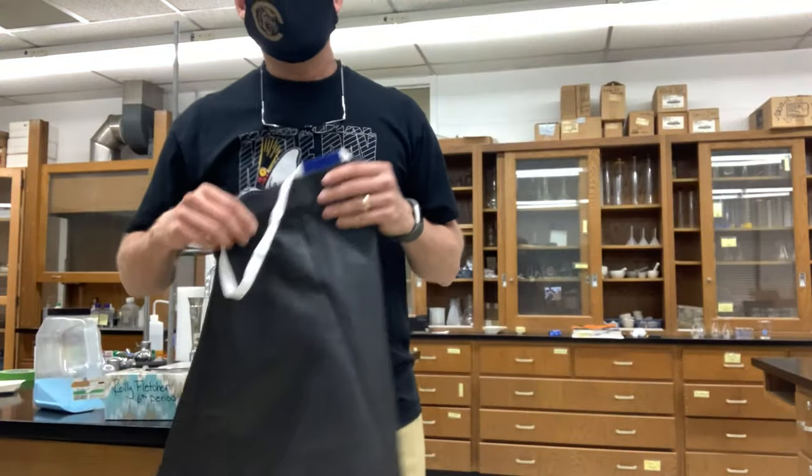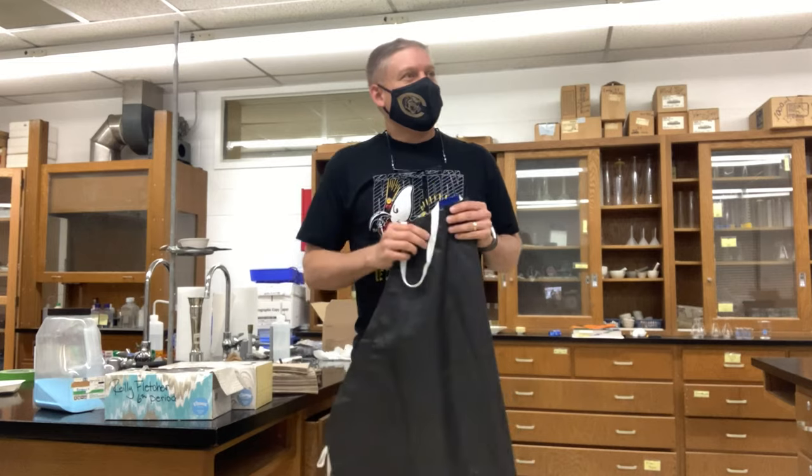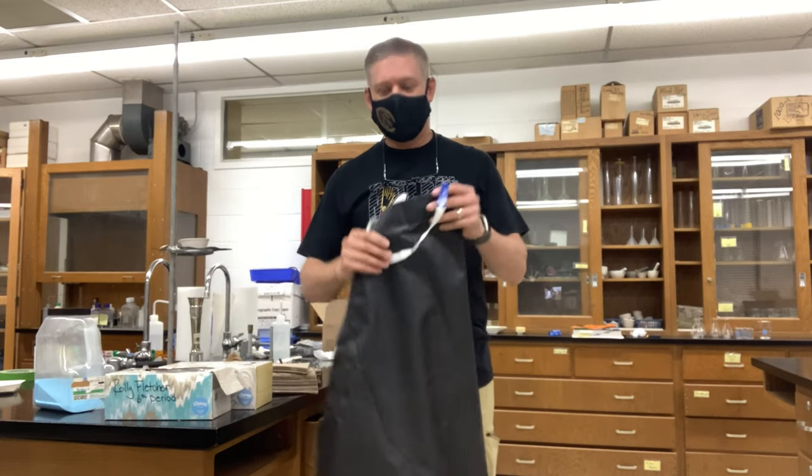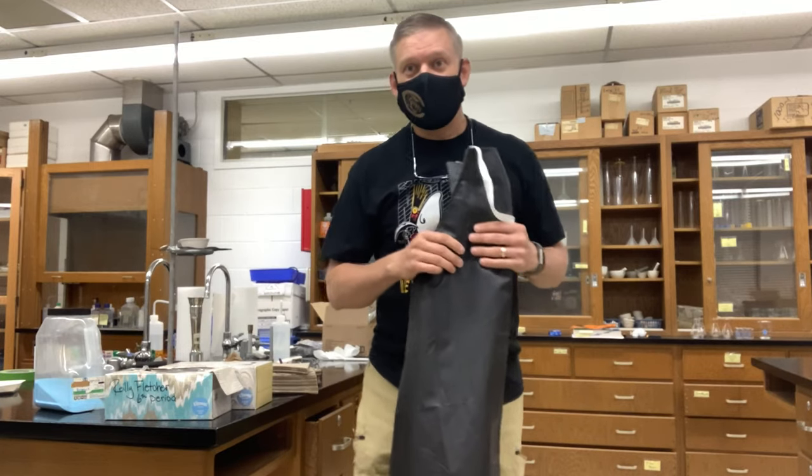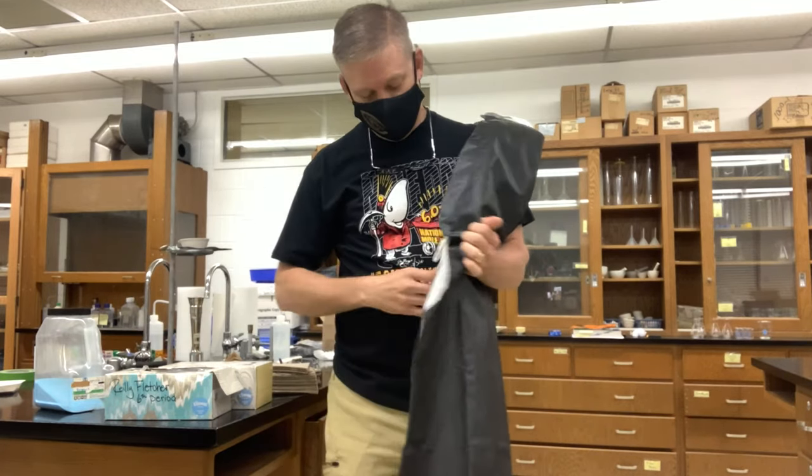Today I wanted to show you about our lab aprons. Some people have had trouble with their lab aprons, especially tying them. So I cannot take credit for this, but I'm going to video it and give credit to my wife, Mrs. Dina Hood.